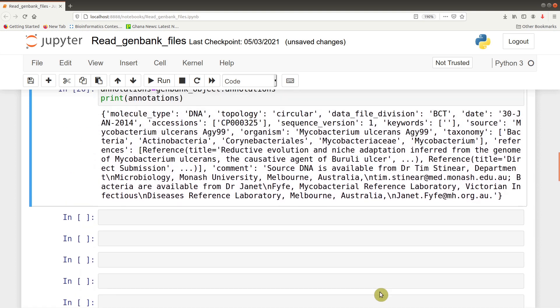Now we are getting to the interesting parts. GenBank files contain what are called features — the sequences in GenBank files are categorized into features, and features have types. In a bacterial genome, feature types could include CDS, genes, and others. You can query and see all the types of features present in this genome.